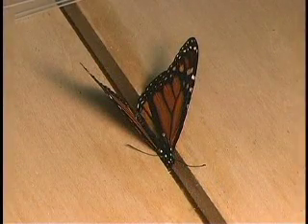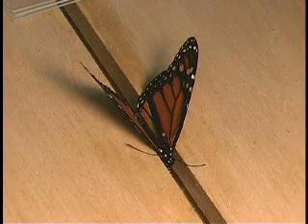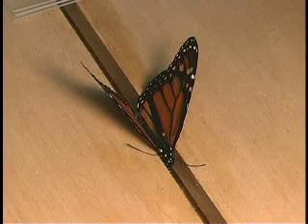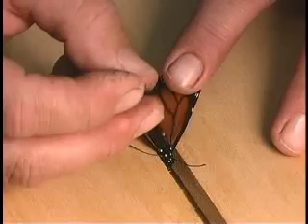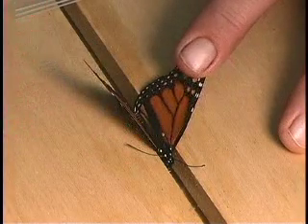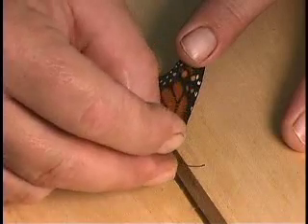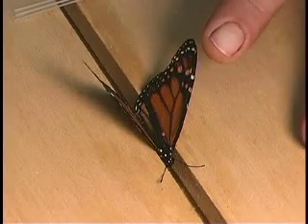Okay, now there's 2 ways you can mount or position the wings on Lepidoptera. And the first way, and sometimes others don't like to do this simply because by doing this and inserting the pin into the wing, you're actually going to leave a small hole. If done properly, it's barely noticeable, and it is generally the easiest and quickest method for spreading Lepidoptera wings. And I will demonstrate that method.